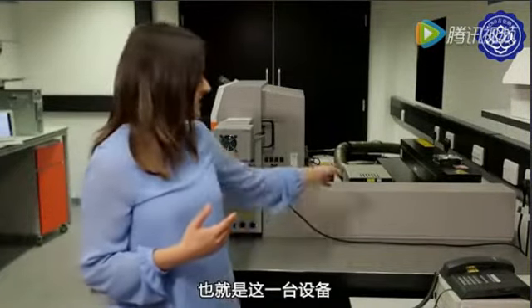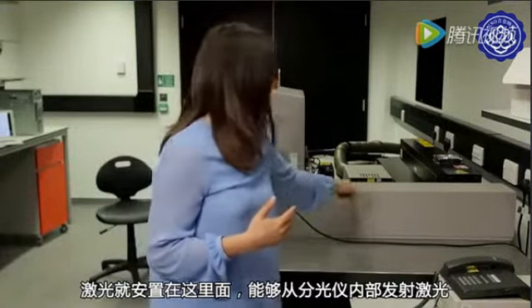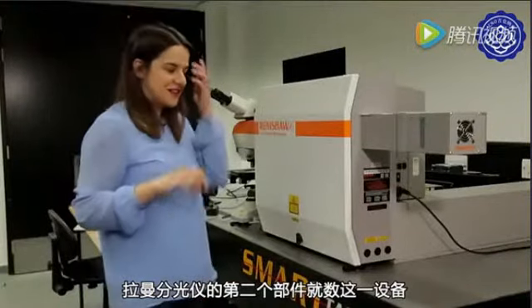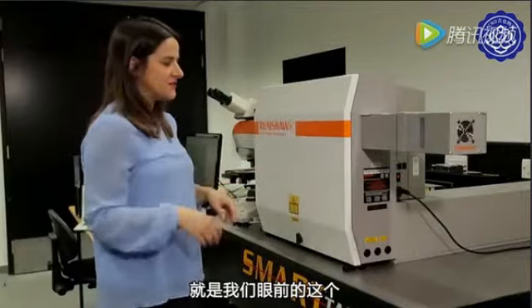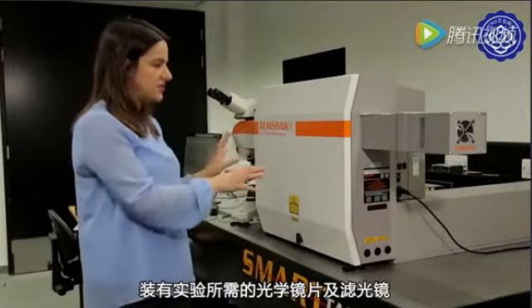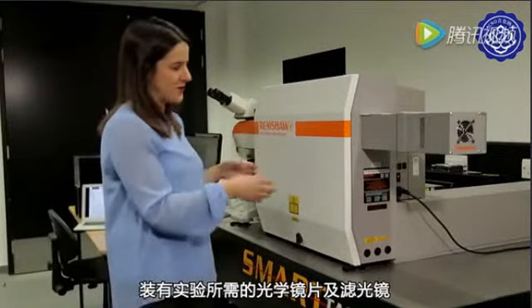You can see indeed that here the laser beam is sent inside this box, which then sends the laser inside the Raman spectrometer. And finally, the third component is the optical microscope. The second component of the Raman spectrometer is this box that you can see here. The first component is the laser, and then in this box there are the optics and the filters that you need to do Raman spectroscopy.